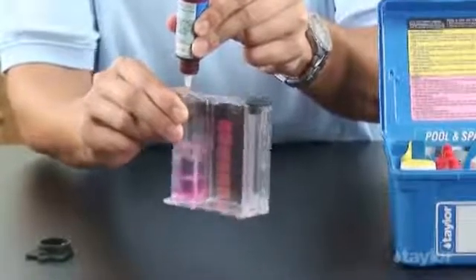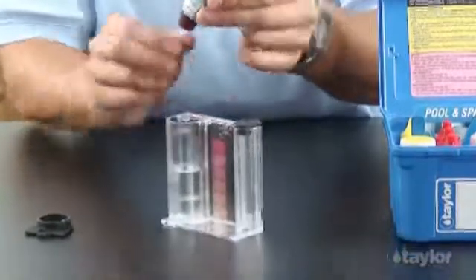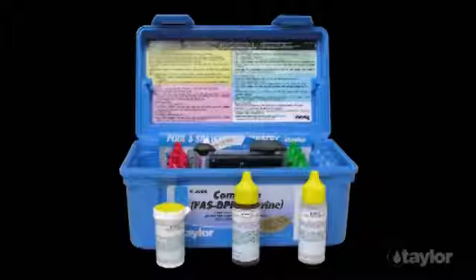Very high levels of sanitizer that would be off-scale on a color comparator are easy to determine by counting drops. And the distinct change in the treated water sample from a color — pink — to no color, is easy for everyone to see.